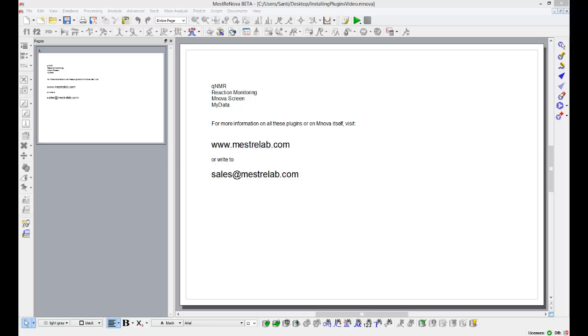Hi everyone, this is Santi Dominguez. Today I want to talk to you about adding new plugins to your MestreNova distribution.